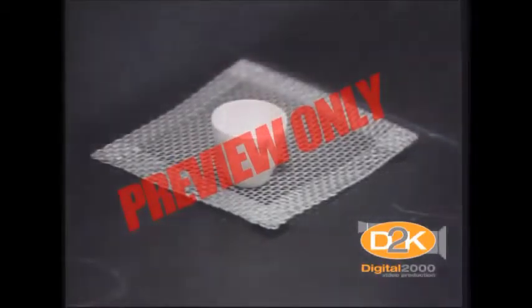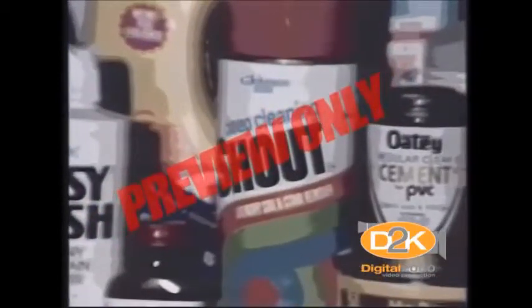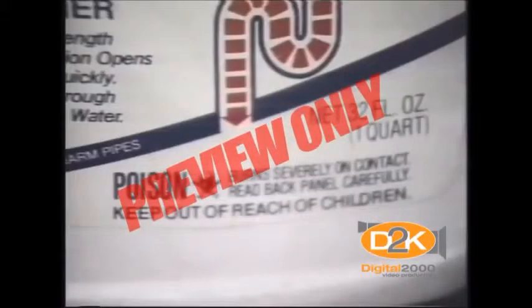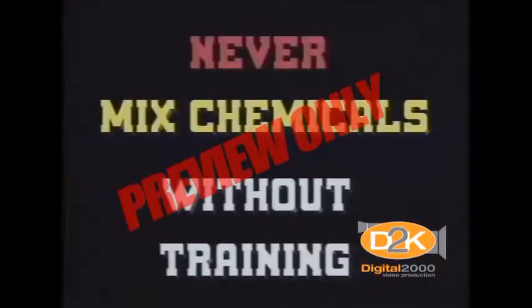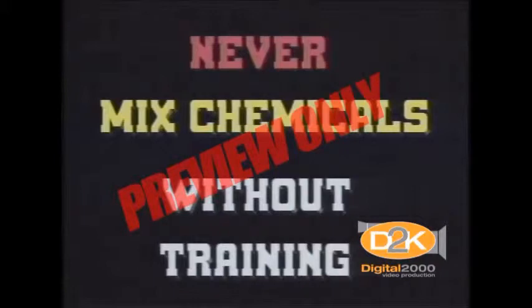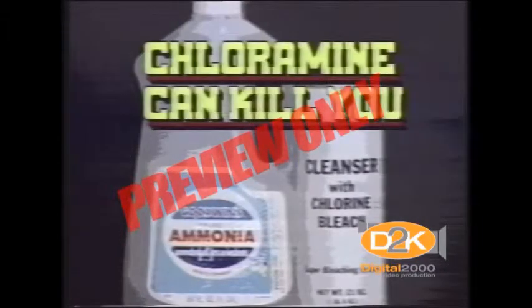Keep in mind these same basic chemicals and hazardous materials can be used and stored in your home. Read the labels on some of the chemicals in your home. One rule you should always follow with chemicals is to never mix chemicals without proper training or knowledge of what you're doing. Sounds too simple, but each year there are many deaths in the home from people mixing common ammonia with a chlorine-based cleaner. You see, mixing ammonia with a chlorine cleaner creates a deadly gas called chloramine.